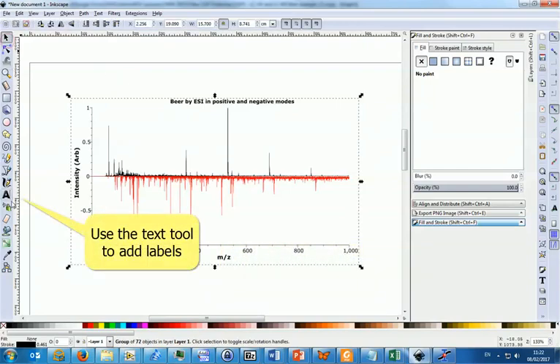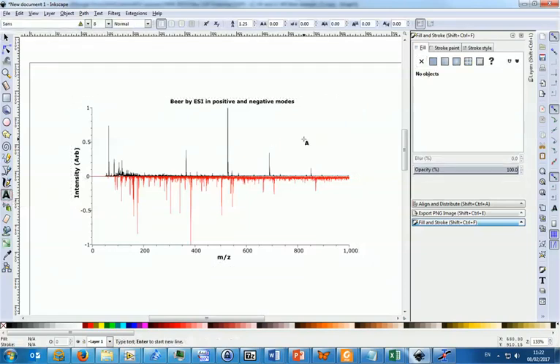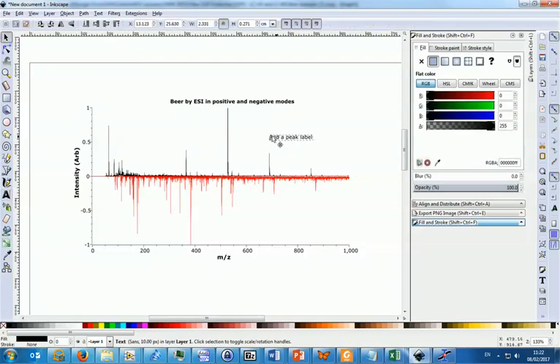Use the text tool to allow you to add labels onto any drawing. Type the label of the first peak you want to label. Note either use a label number like peak 1 or actually type the ionic formula of the ion you've assigned. Move the label near to the assigned peak.